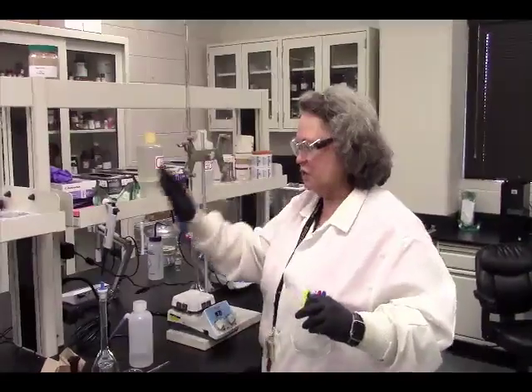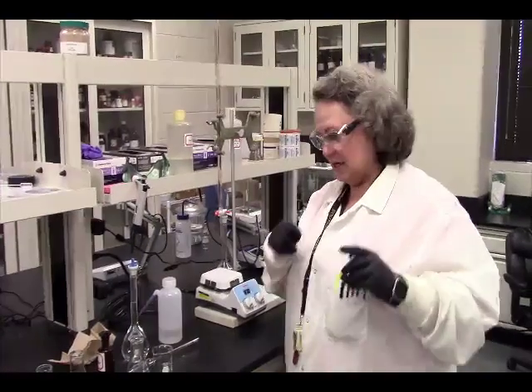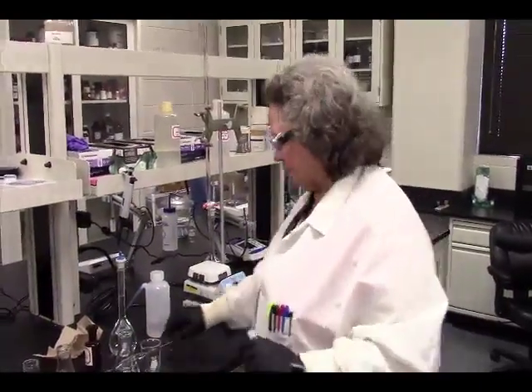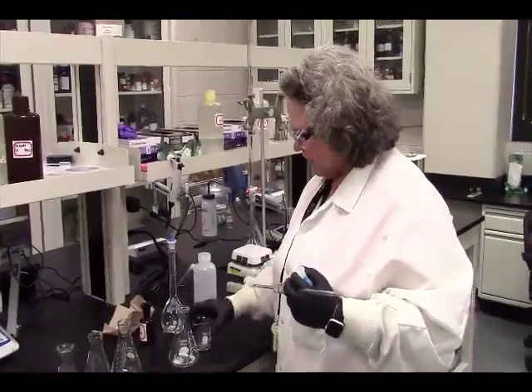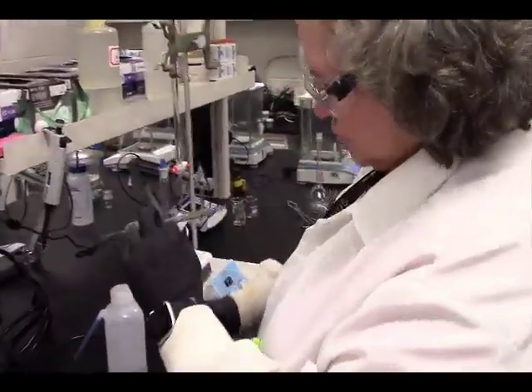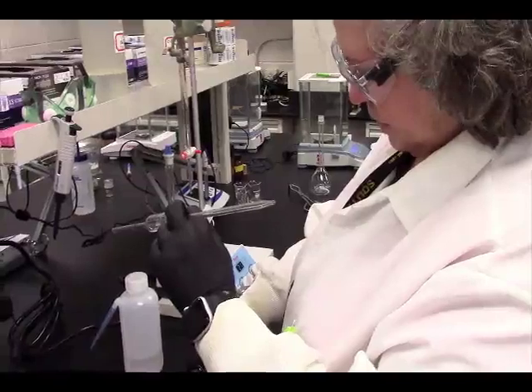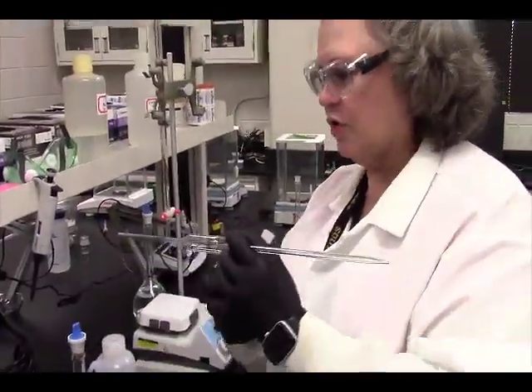Now, we have to use our potassium iodate as a primary standard and not the sodium thiosulfate, and I need you to tell me why in your report, why it has to be that way. And so we're using potassium iodate as our primary standard, and then the thiosulfate will be our secondary standard. All right, so to this we need to add 25 milliliters of our iodate solution. I will put the quantities that we used in Canvas so you'll know how that was made for your calculations.